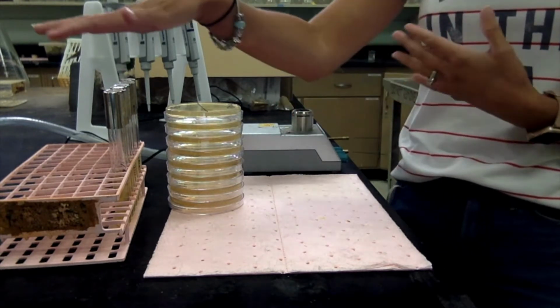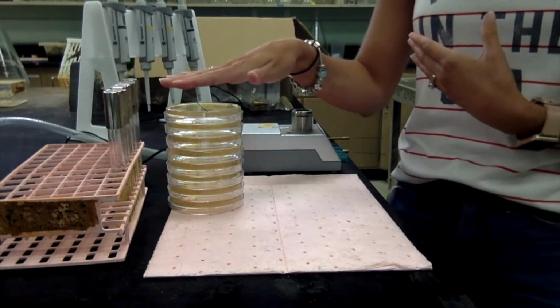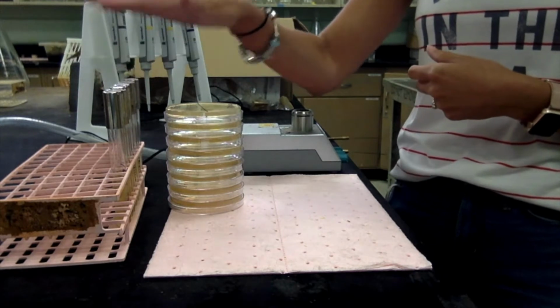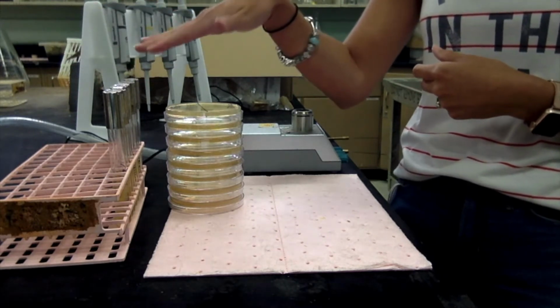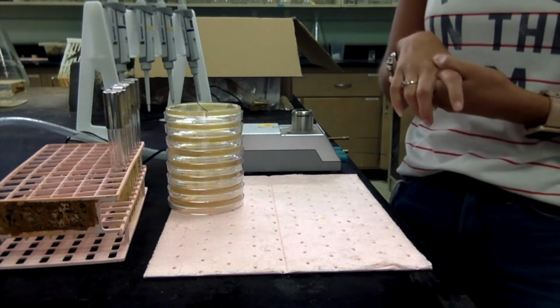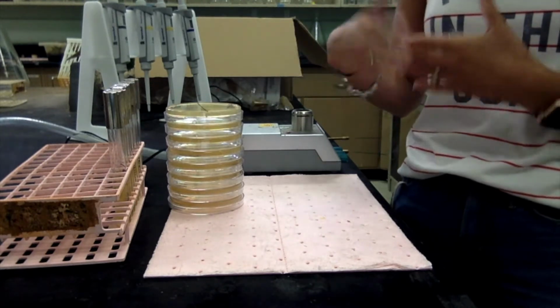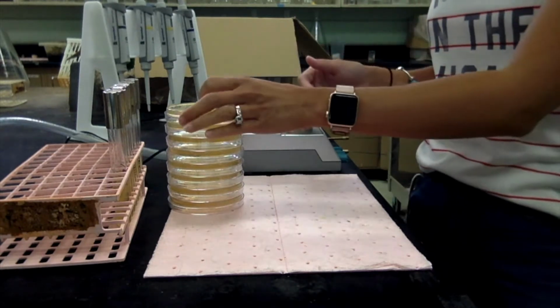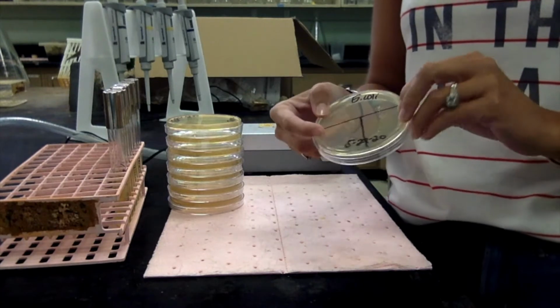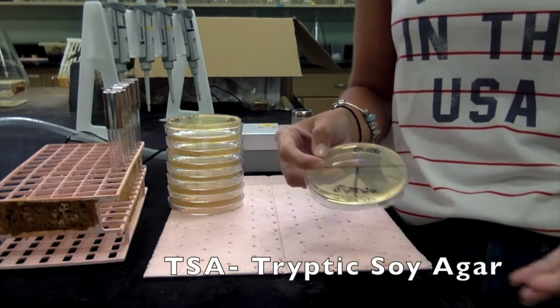Another way to do that is with a broth culture. So I'm going to use a broth culture today to demonstrate the streak plate for you. Now these are my cultures, so these are already pure. I know that there's no other kind of bacteria in them except for what's written on the tube. This is a way that I keep my bacteria fresh, as I streak them on plates every couple weeks. This is just TSA, or tryptic soy agar, and it's a general purpose media that all of my bacteria can grow on.